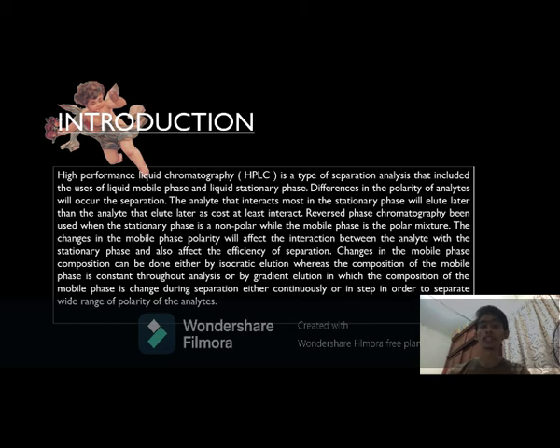The introduction is: high performance liquid chromatography, or HPLC, is a type of separation analysis that includes the use of a liquid mobile phase and a liquid stationary phase. Differences in the polarity of the analyte will occur during separation. The analyte that interacts most with the stationary phase will elute later than the analyte that interacts least.